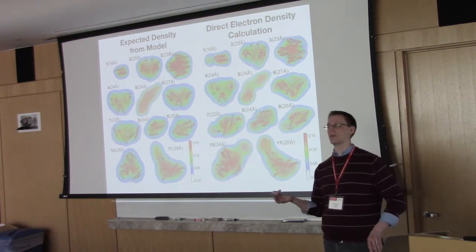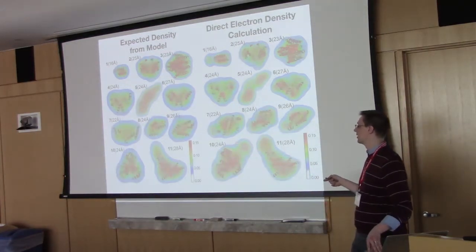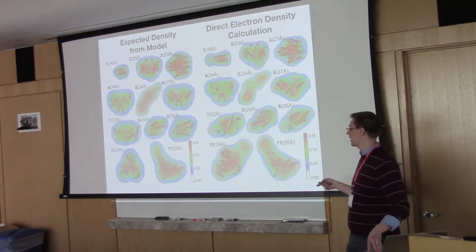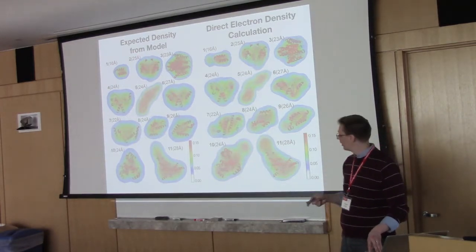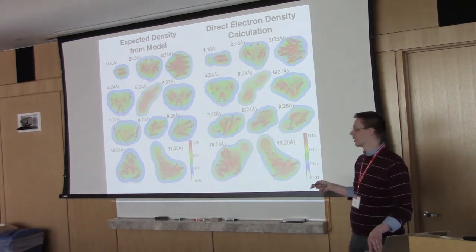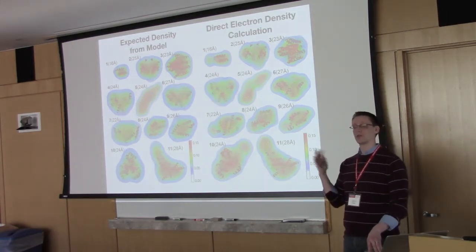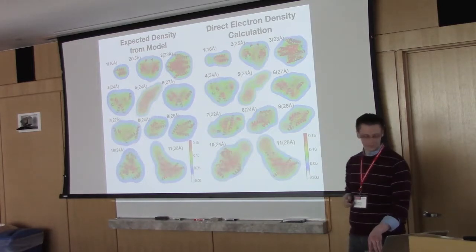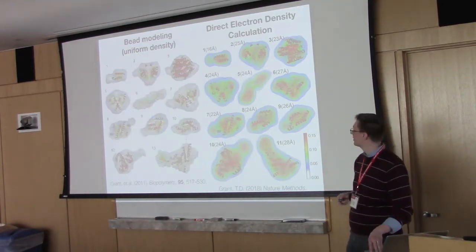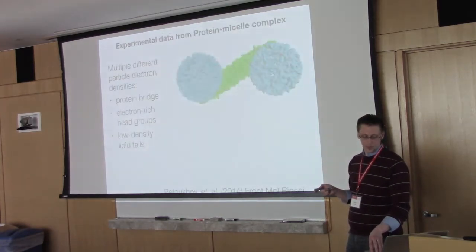And again, just like we saw from bead modeling, you can see extra regions where the unresolved density from the crystallographic structure corresponds to, say, 15 or 20% of the structure. You can actually see that in the density as well. And in this case, for example, you can see potentially why it's not resolved in the structure. It's less dense there, which means it's less rigid there, which means it's probably flexible, and so it's flopping around.